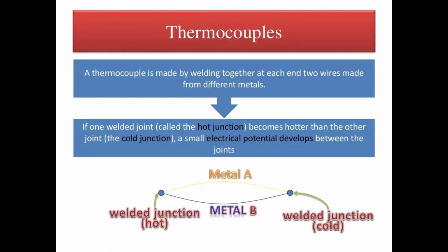Next, detectors. There are 6 detectors in infrared spectroscopy. First one is thermocouple. Thermocouple lo 2 different metals use చేస్తారు. 2 different metal wires are joined together at each end. So you can see 2 metal wires. These are joined together at each other, at each end.